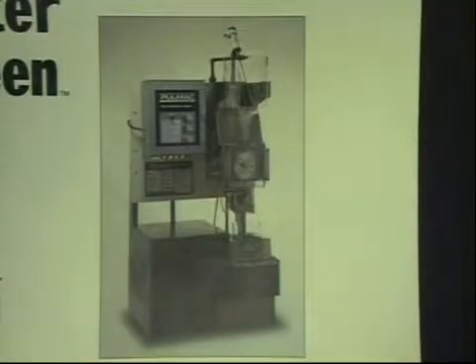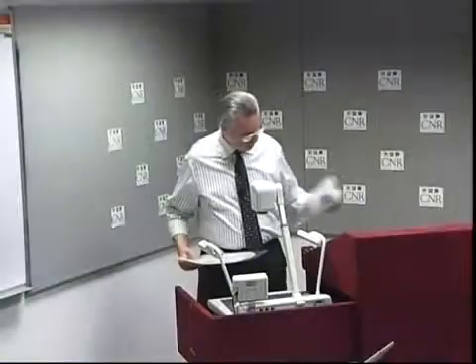This is an automatic machine. It works quite simply. It is a little bit pricey, but the results are consistent, and they are used in the process readily. We get from the POMAC, ooh, a lot of gloss on there.